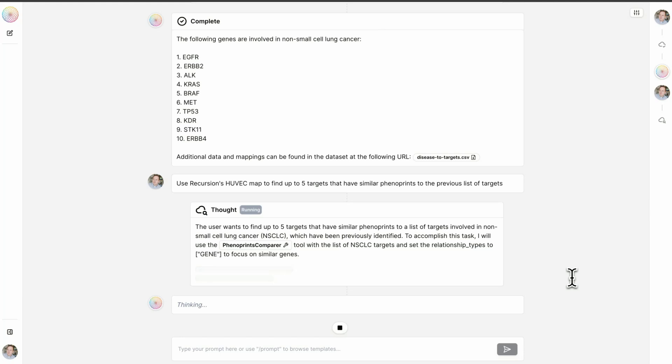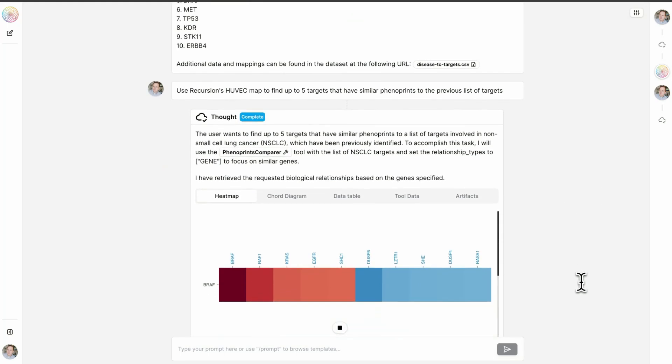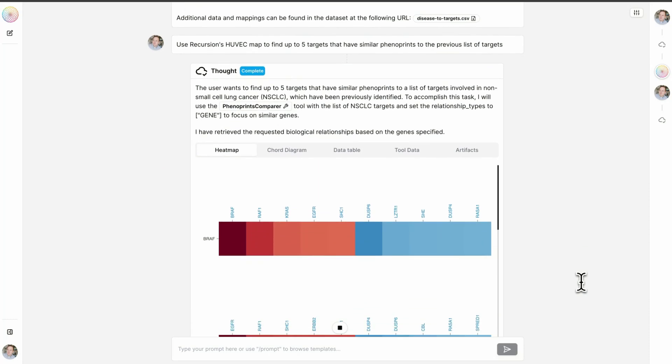We are querying trillions of relationships that we have predicted from hundreds of millions of real OMIC experiments conducted at Recursion.